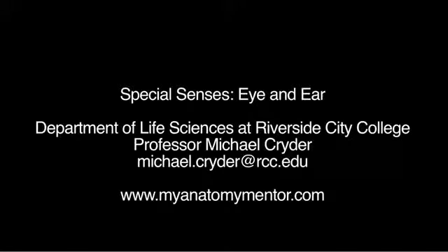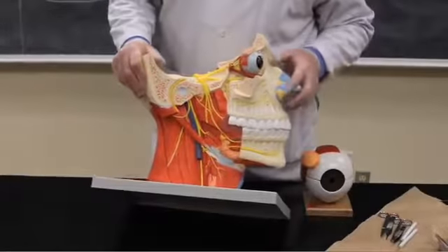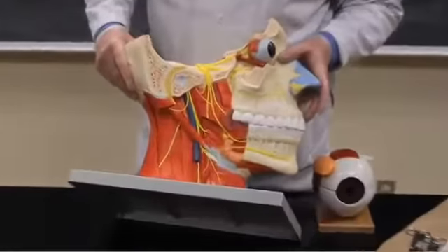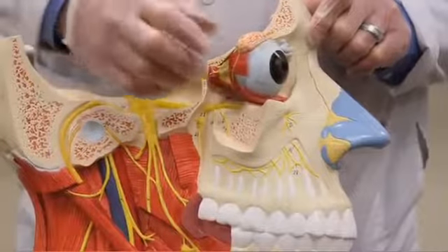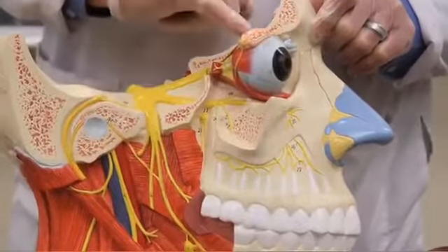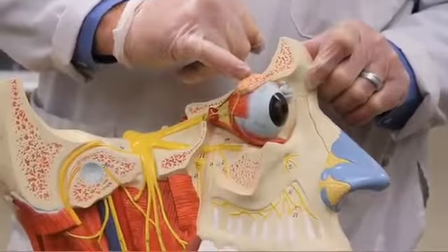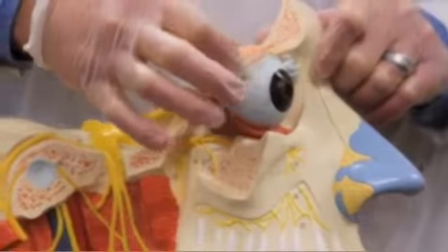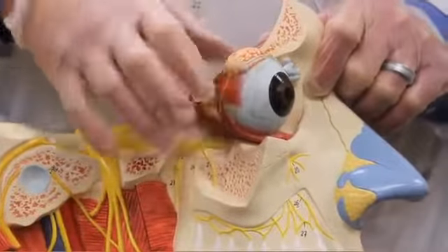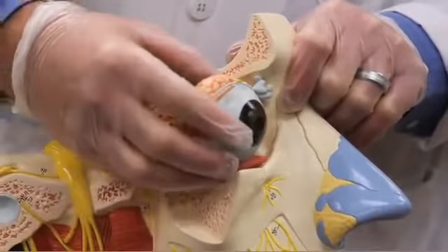Okay, what we're looking at is the structural components of the eye and ear. We'll look at a dissection of the eye, but we'll start out with structural landmarks. On the eye, first of all, this is the right eye, and we can see the lacrimal gland, which is always superior and lateral. That superior lateral gland is going to be a good landmark for determining right side or left side. So if it's superior and lateral here on the eye, then this would be the right eye that we're looking at.